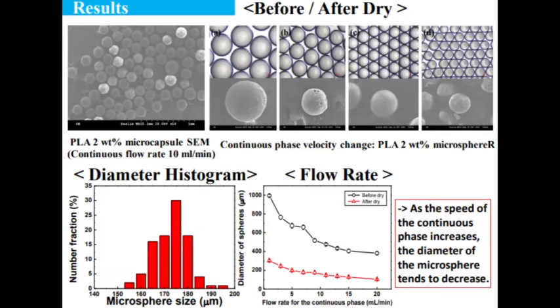We were able to manufacture microspheres using the emulsion method with the prepared solution and make a certain size using a syringe pump and hose. As the speed of the syringe pump increased, the diameter decreased. As a result of CV measurement, the deviation was the smallest at a speed of 10 mL per minute, and a porogen was added at that speed to produce pore-structured spheres.